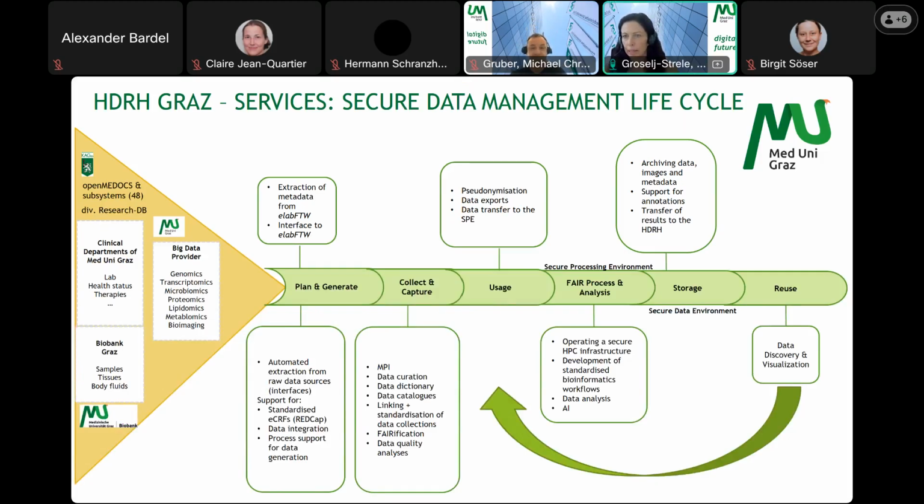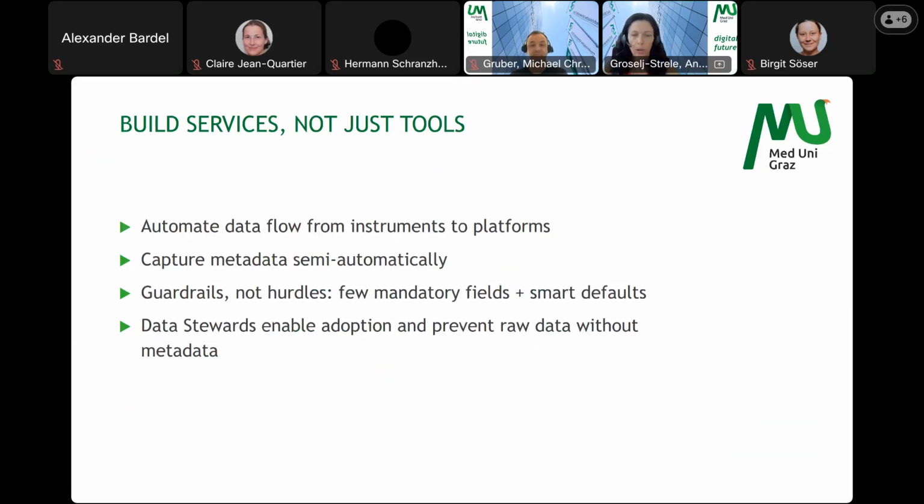Michael can give you some impressions about his daily work. It is really important to offer services like consultations, trainings, e-learning tools, but also things like automated data transfer pipelines. This situation, maybe we can explain a bit.